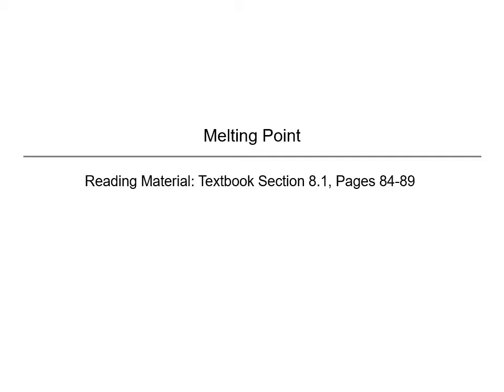In this lecture, I will be discussing the properties of melting points. Melting point of solids is a useful tool in helping to identify compounds as well as determine their purity. Solids melt when the temperature is raised and the tightly packed crystals of a solid start to break apart into liquid form. This can be seen as the melting point of the solid.